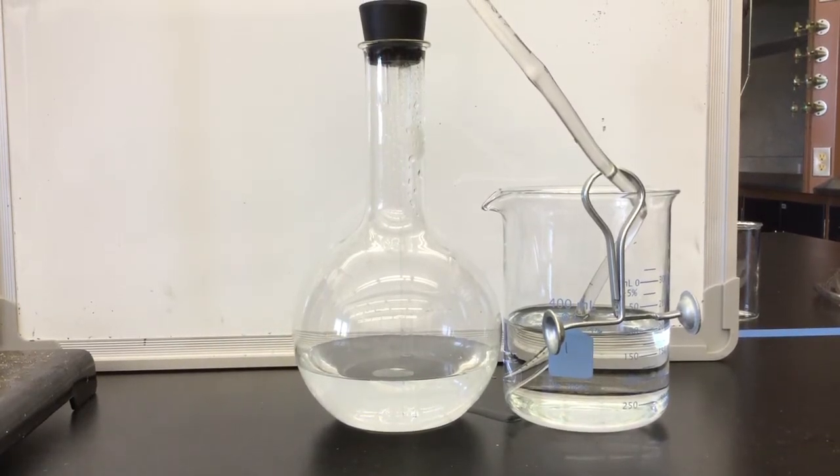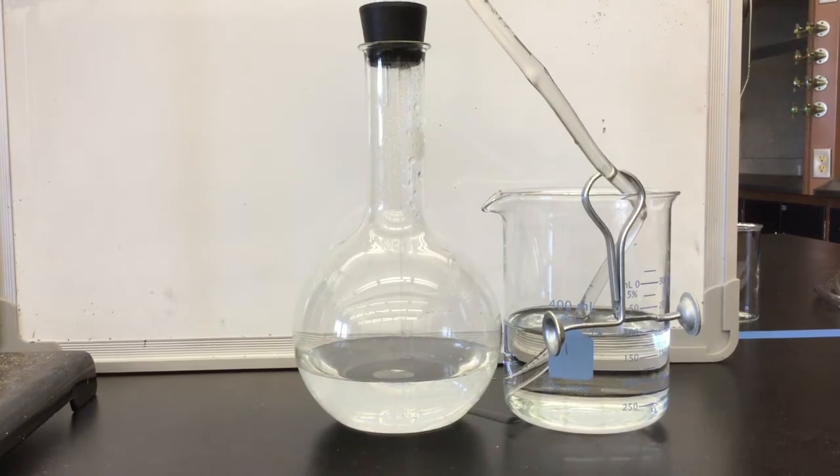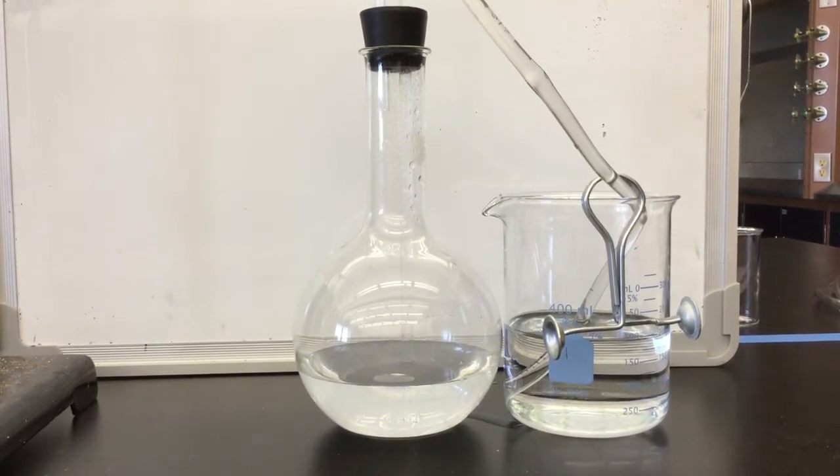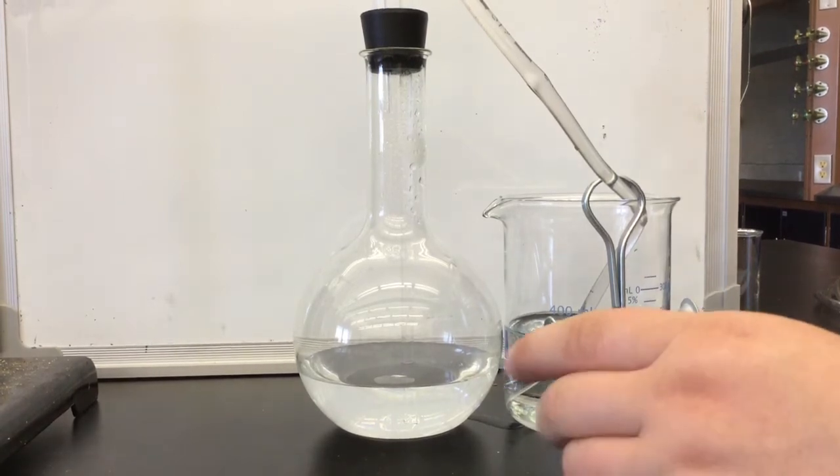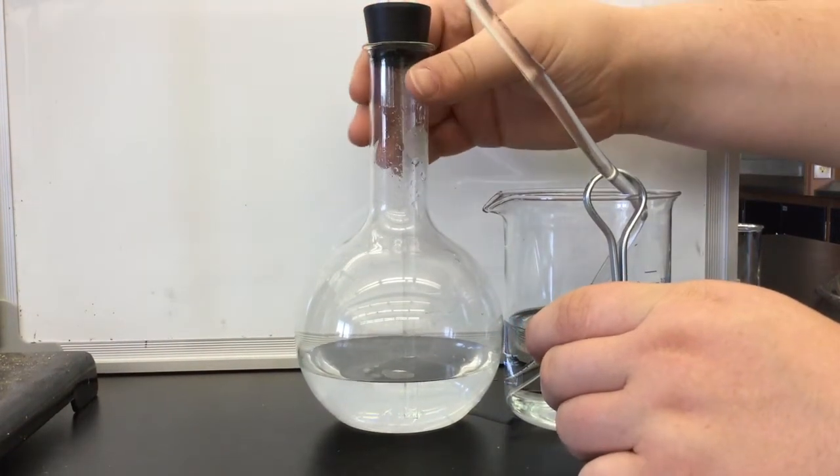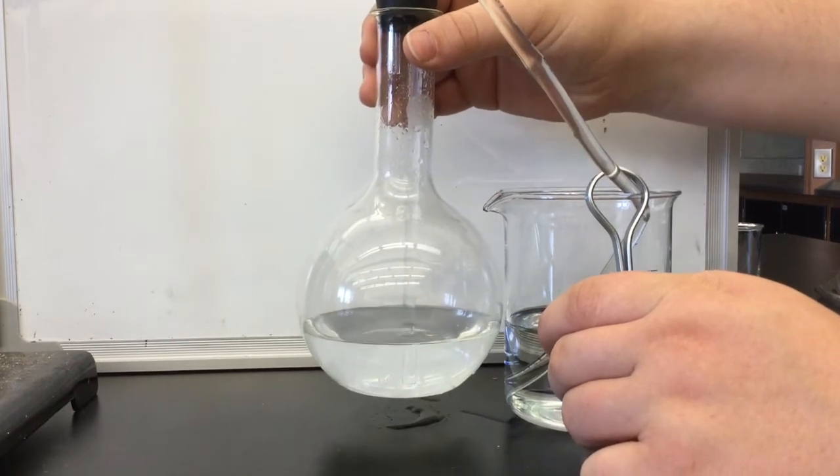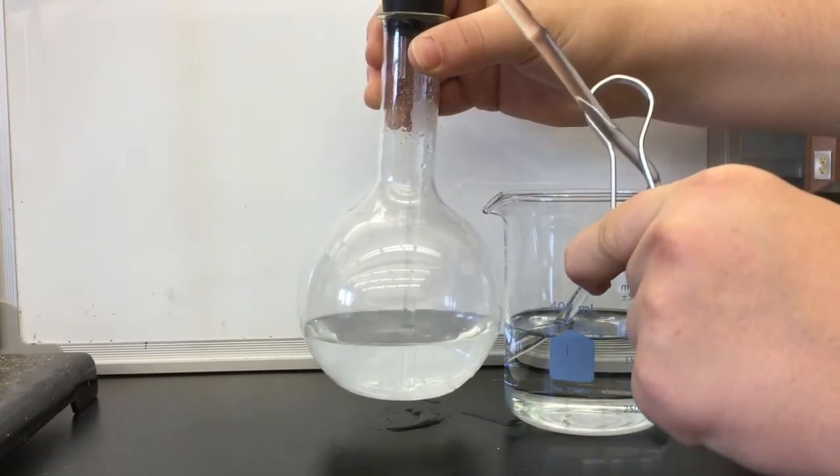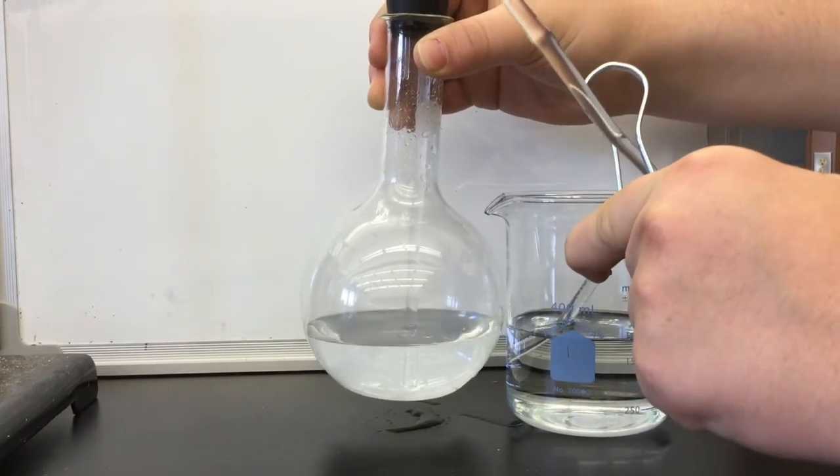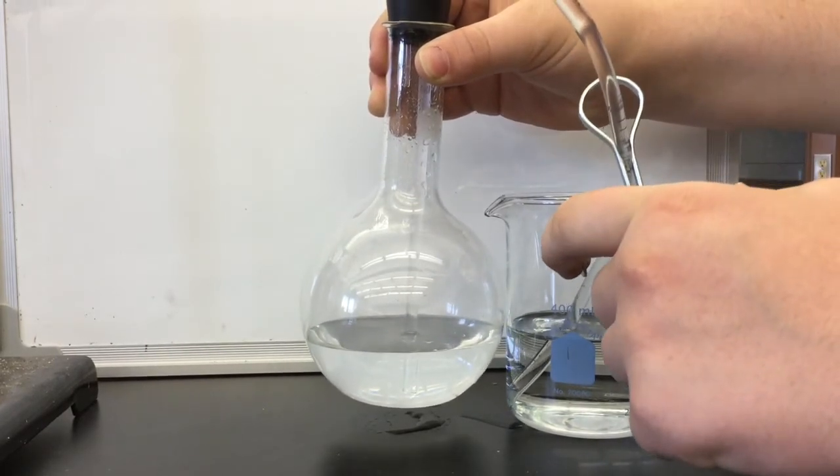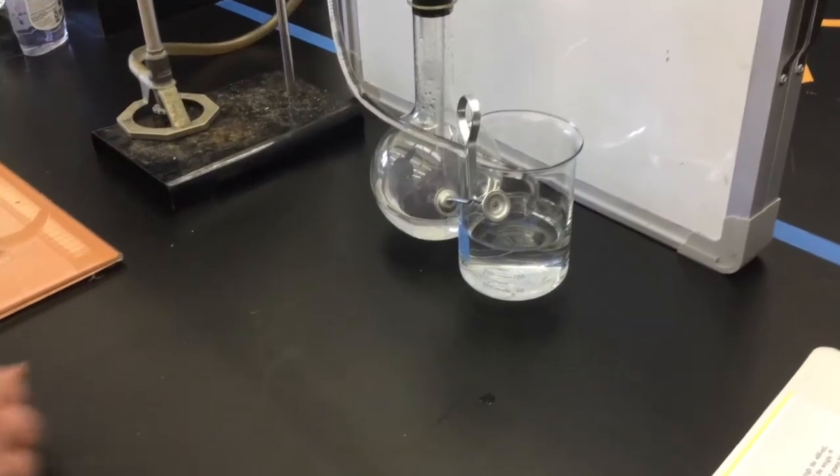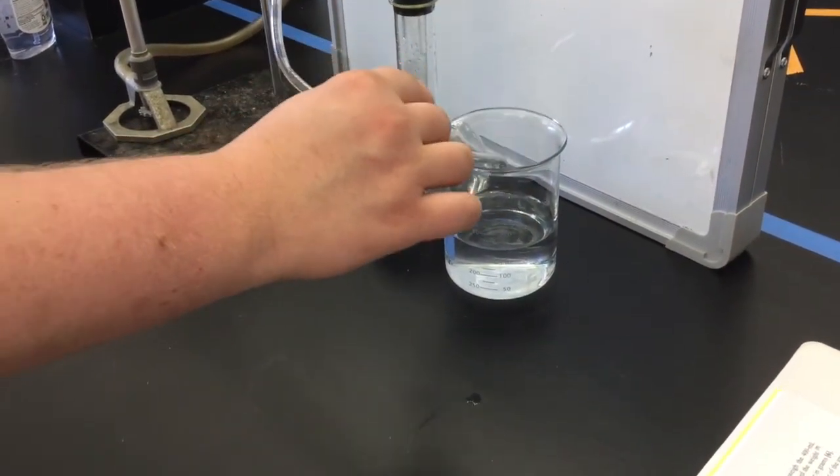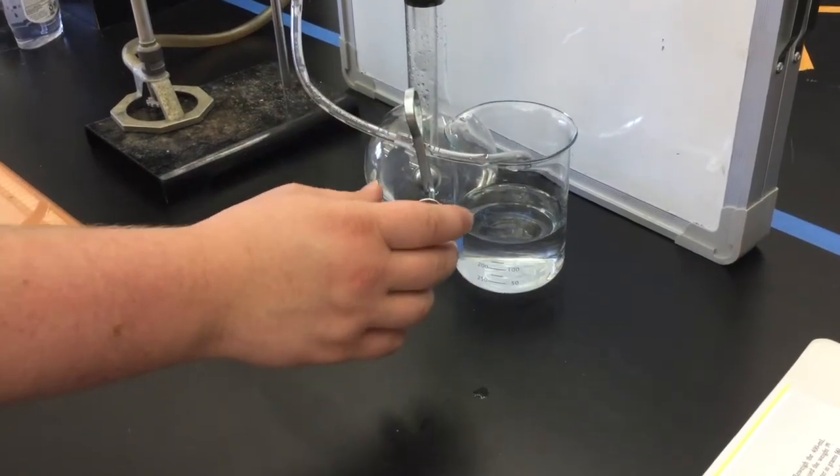You'll notice that again the water levels are not quite the same, so you're going to need to raise and lower either the beaker or the flask until the water levels are the same, and then secure the pinch clamp. Again, it may be helpful to use a book or some other object to keep the flask or beaker at the appropriate height. Remove the tubing from the beaker, and then we will re-weigh the beaker and record the mass to determine how much water is in.